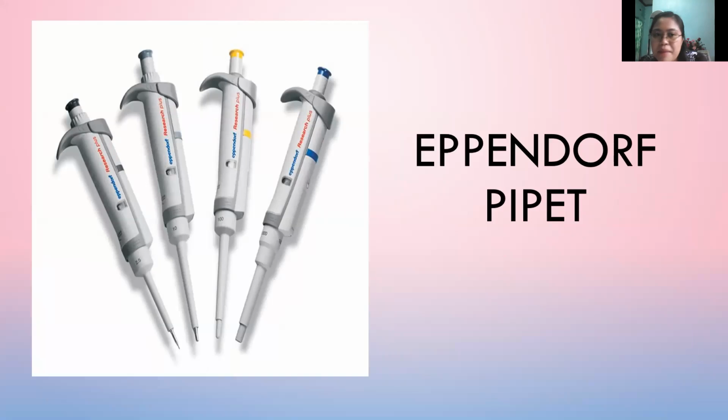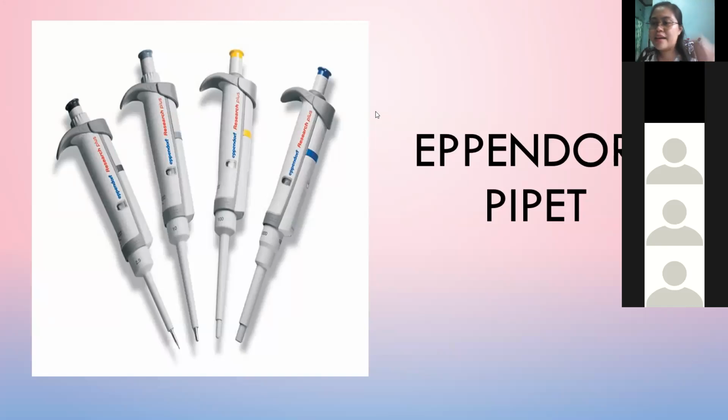So it has a tip, right? I believe you have used this. And you have to drain everything, because it has two stops. If we push this button here, the first stop drains what entered the tip. And then another push, the second stop is for the air displacement so that everything inside the pipette is emptied. So it is still a blown-out pipette but with the help of air. So air displacement is its way of draining. Questions about the types of pipette, class?